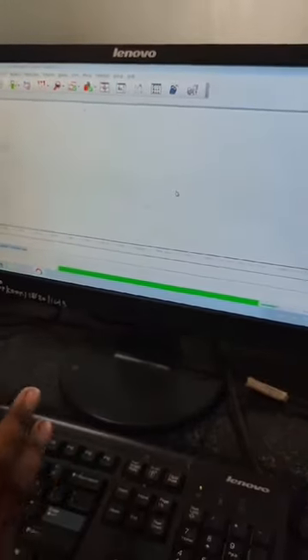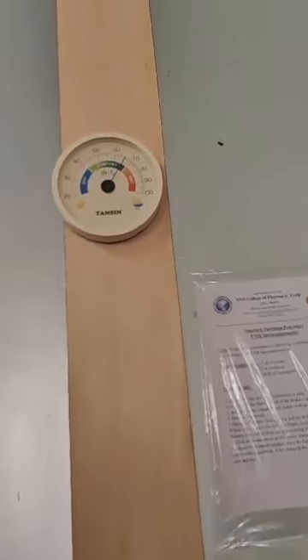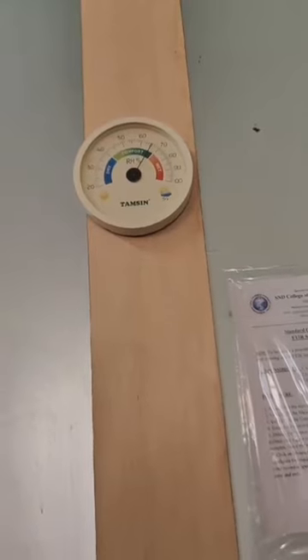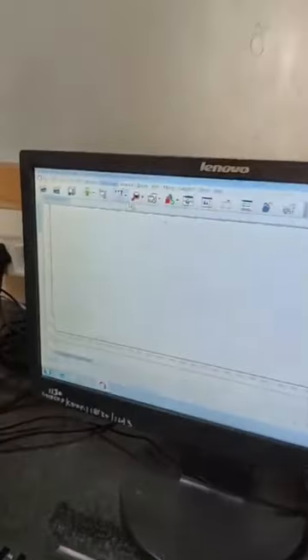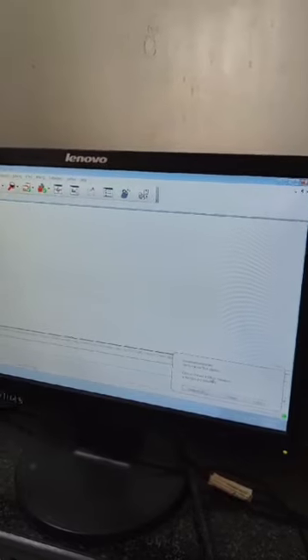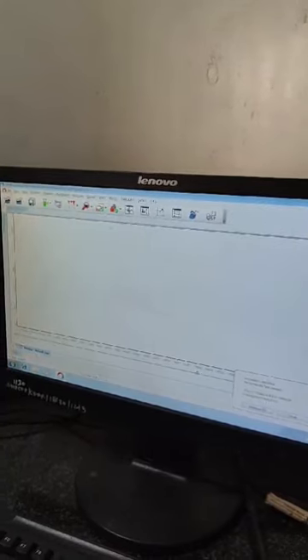Here you can see in green color it performs different tests. If we get a green color mark, it indicates the instrument is okay. Another important thing: in the IR room there must be an indicator for relative humidity. If the environment is wet, we cannot perform IR analysis. The OPUS software shows 'accessory identified, performance test passed' — this is automatically performed whenever you start the instrument.